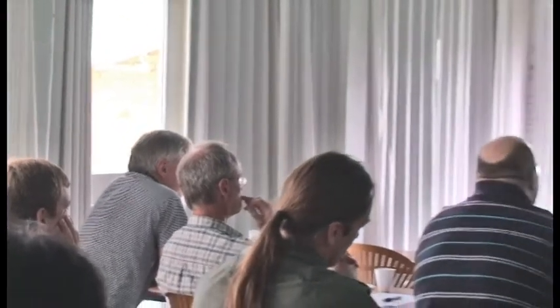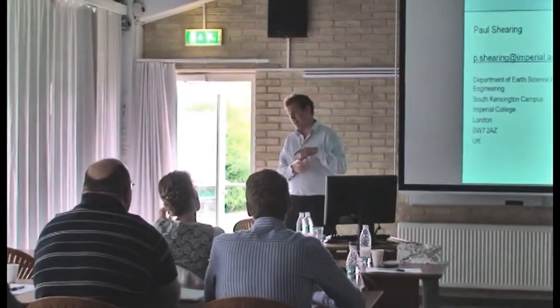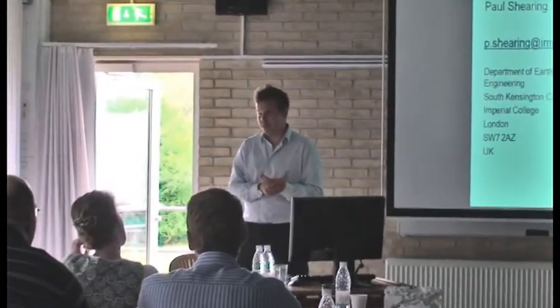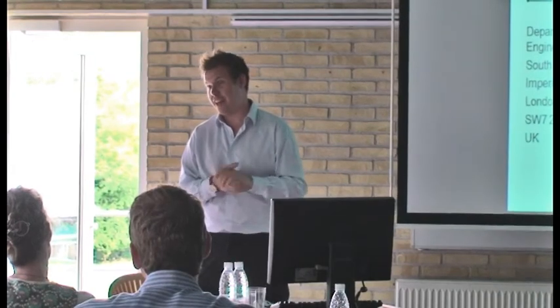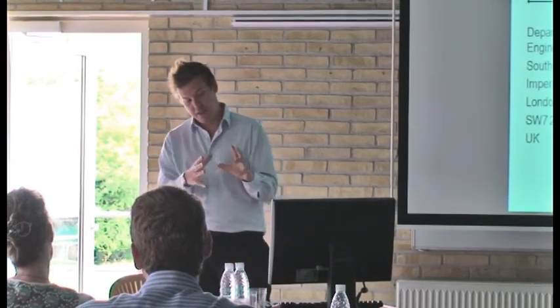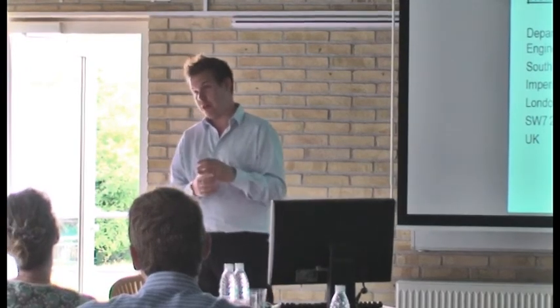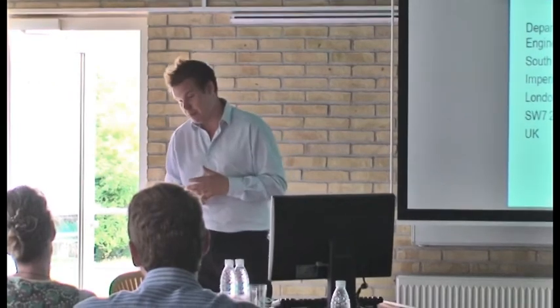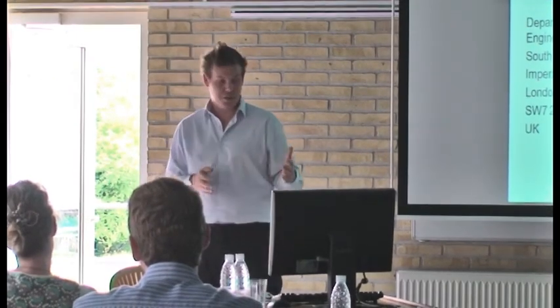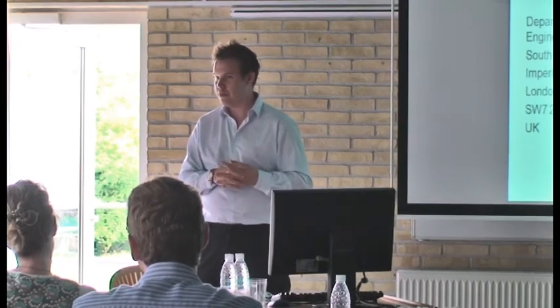So we've looked at the same bulk sample, the same pellet, and done some FIB work and some X-ray nanoCT and compared the measurements. That's maybe a somewhat ambiguous comparison, but they compared remarkably well. So we looked at the same X-ray sample in large field of view and in high resolution mode, and then a FIB section from the same pellet, and they compared very well. We've not actually got to the point where we've sectioned one of these things on a needle, but that is something we're looking to do.